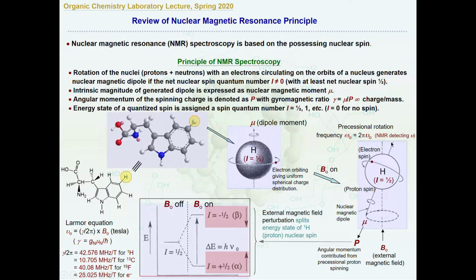It will be tilted most of the time, just like the Earth's tilt orbiting around the sun. Right? Around the sun, it is tilted, and itself is also self-rotating. Every day we have the Earth turning around, self-rotating. Even at the atomic level, it will still behave with identical phenomena in here. So once they are tilted at an angle and they self-rotate, it turns out to be rotating on this vector, on this deformation, and that's the rotation that we use to set up the NMR measurement.